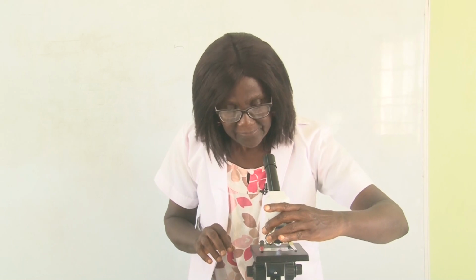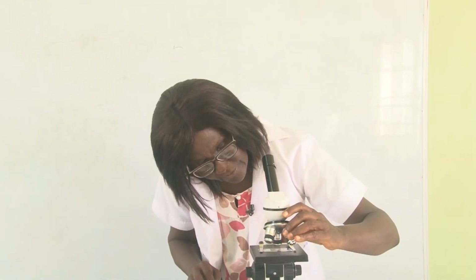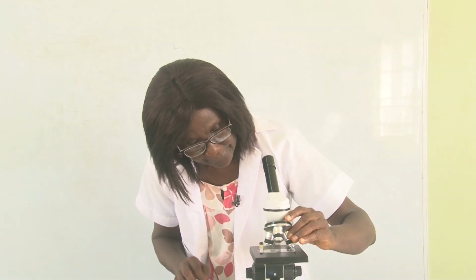We now want to use oil immersion to look at the image very, very well. All that we need to do is to turn from high power back to low power, and then take off the high power lens that we used.